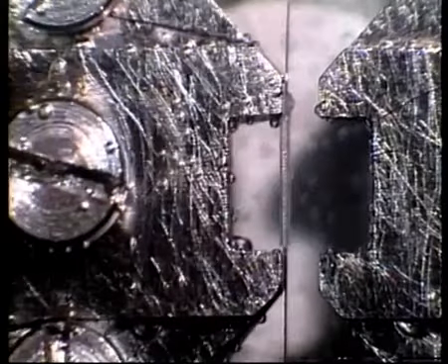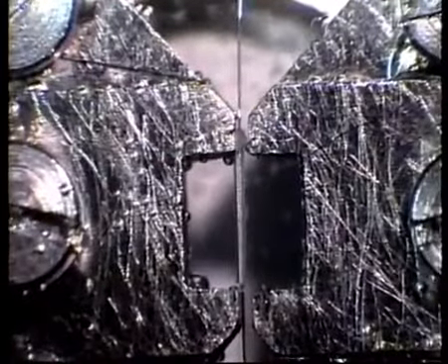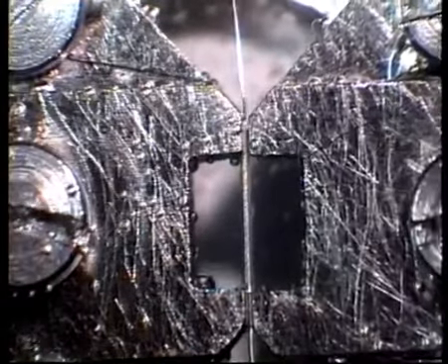When there is sufficient wire pulled through to reach the screws, the jaws are moved together to clamp the wires. Place the second wire underneath the first wire. If the second wire is on top, you easily risk that the wire slips upwards and destroys the vessel.